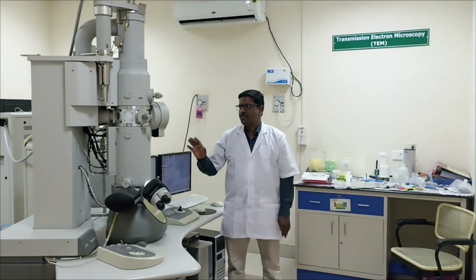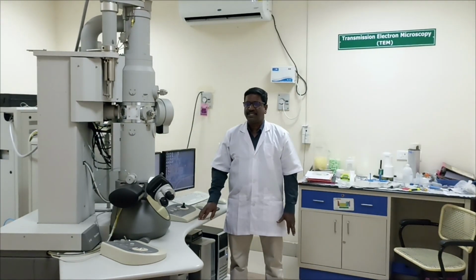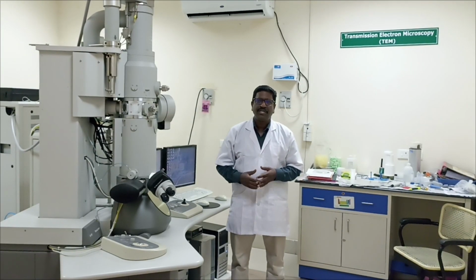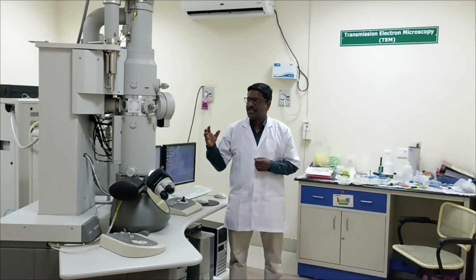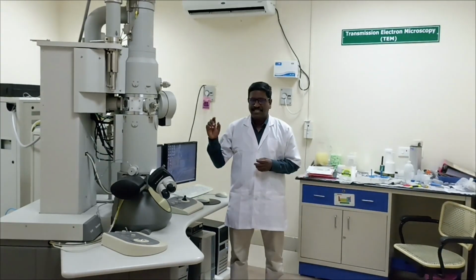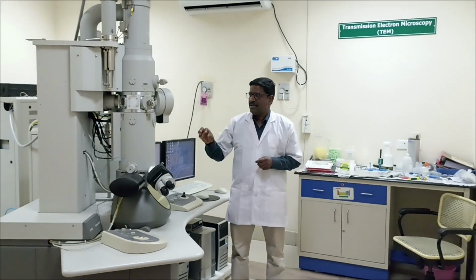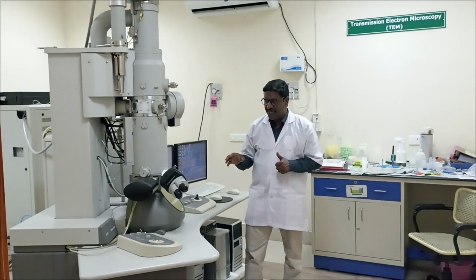The principle of transmission electron microscope is that when a beam of electrons interacts with the sample, the electrons pass through the sample. While passing, the electrons carry the information of the sample at a nano level. Using this machine, we can have a magnification of 6 lakh times. Having that magnification, we can have a resolution of 0.1 nanometer. It means that using this transmission electron microscope, we can get information at atomic level.